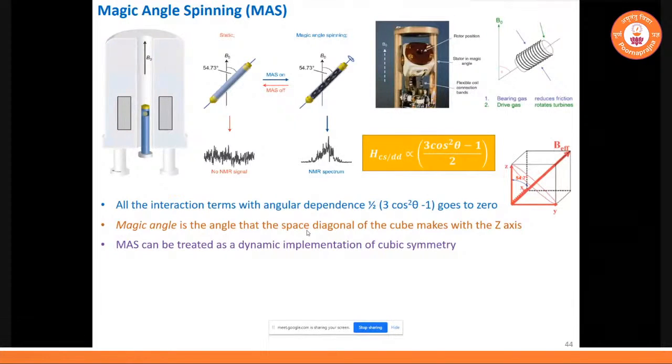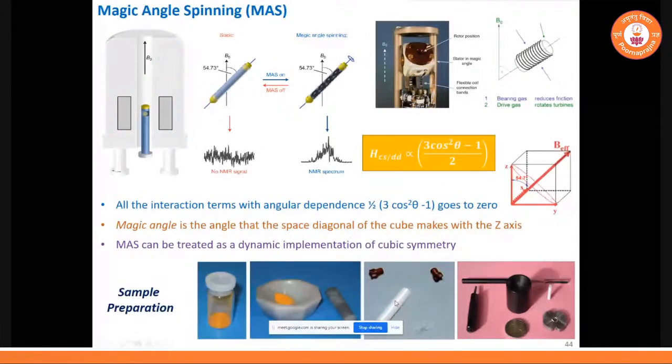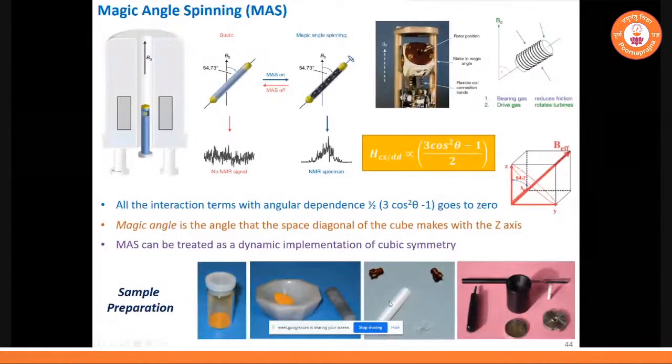Okay, and in solid state NMR, we never use sample tubes. We use rotors or spinners. This is made up of zirconium, where we fill the sample as it is. There is no solvent business here. We take the sample, use a pestle and mortar, grind it into a finely powdered sample, put it inside this, and we close that rotor with the cap. And you can see this cap has fins. So to rapidly spin this sample, we need some dry gas, which will come and hit these fins and it will rotate. Now, of course, your doubt is how fast we have to spin.